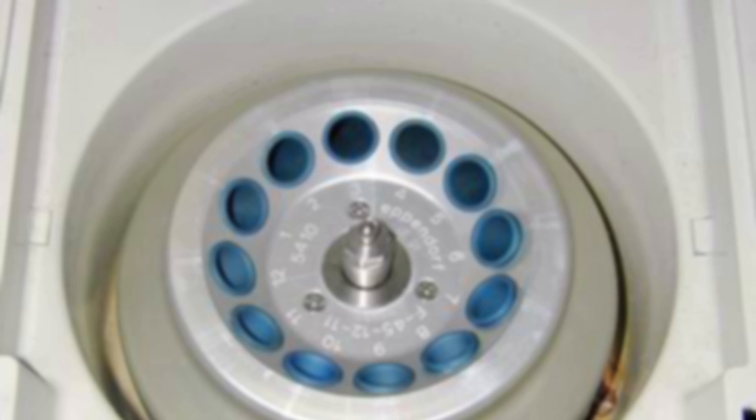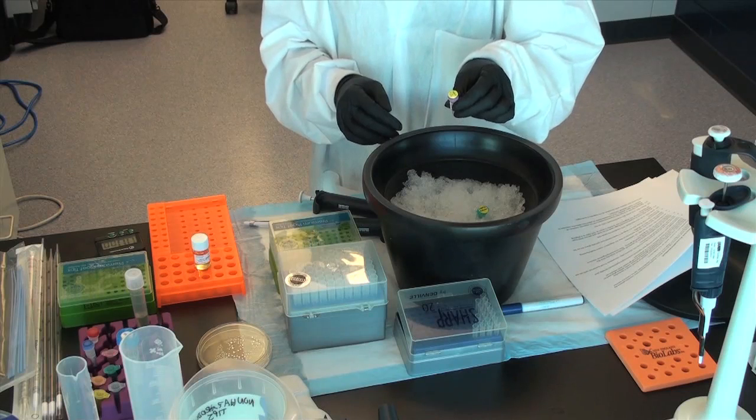Step 11: Place the vial in a microcentrifuge rack on its side and secure with tape. Shake the vial at 37 degrees Celsius for exactly one hour at 225 RPM in a shaking incubator.